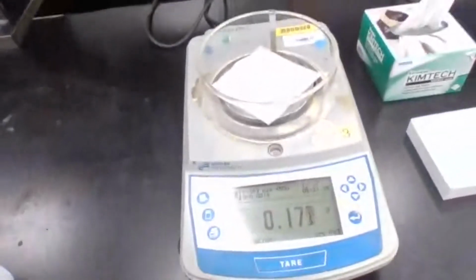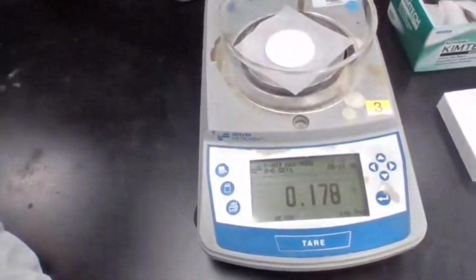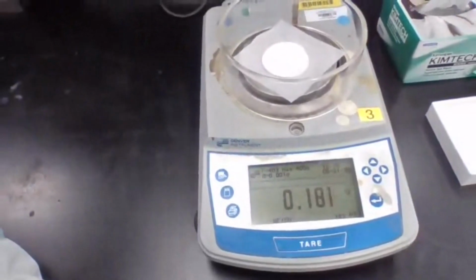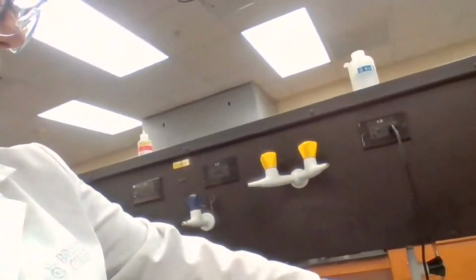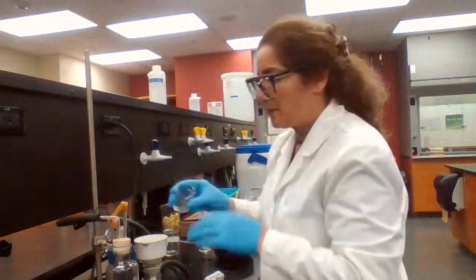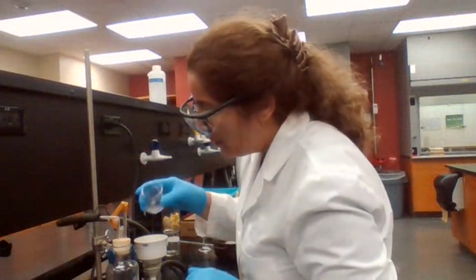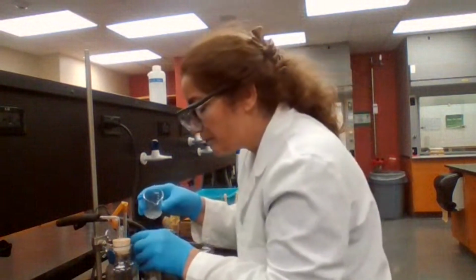Does it show the number? Yes. Okay. 0.181. Turn on the vacuum first.